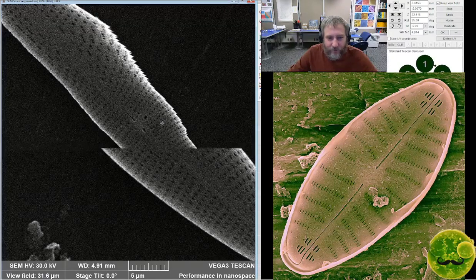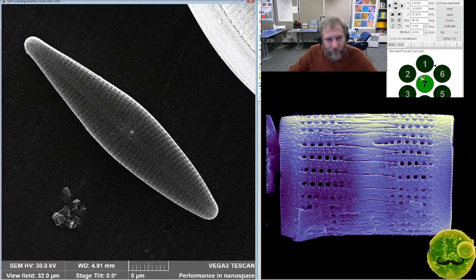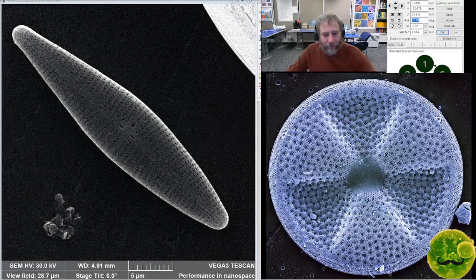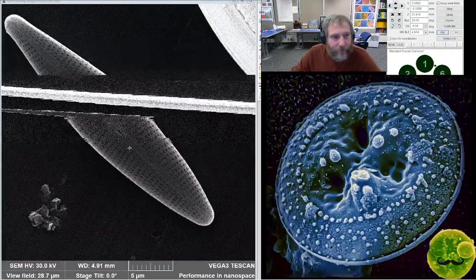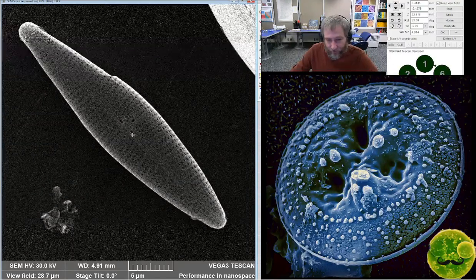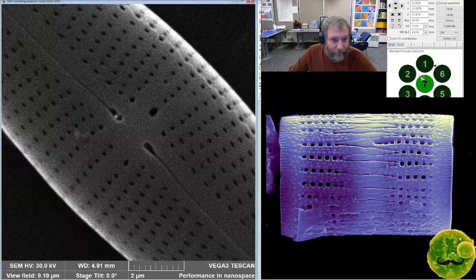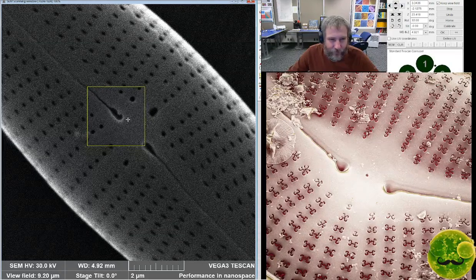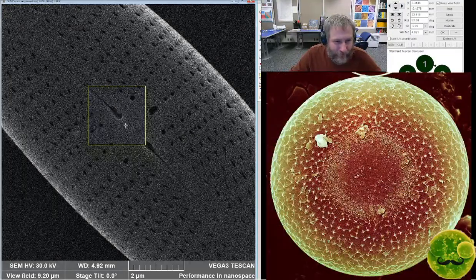And so that took a little bit longer, and then also, we started this project right after, the fall after we got the scanning electron microscope. It took me a while to learn how to get this instrument to take pictures the way I wanted it to, for diatoms and for anything really, and how to prep samples so that the images turned out the way we wanted. Both of those things are a little challenging when you're first starting, because I'd never had an SEM in my lab before that point.